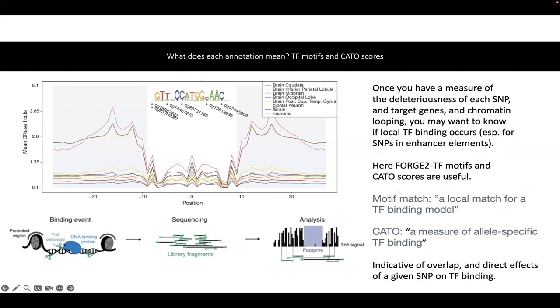We can predict transcription factor binding using DNase-seq because transcription factors leave footprints in the DNase-seq data. Think of DNase-seq as a mark that detects accessible chromatin. The DNase enzyme, or ATAC-seq, is very, very similar. Here's an example of ATAC-seq. These enzymes can only attack the DNA when it is accessible. When Greenleaf developed ATAC-seq, it was based on the same principle. Okay, this is important to take into account. You have all these nucleosomes, and when the DNA is open, the enzyme can go in. So this maps open DNA.